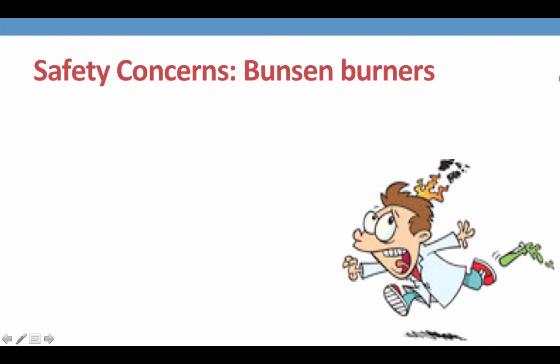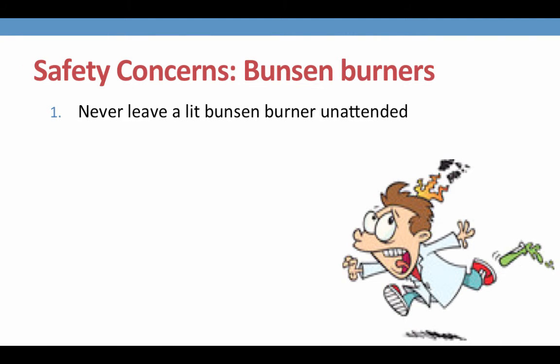Alright, so hopefully at this point you have a good understanding about what's going to be happening in today's lab. I just want to leave you with a few safety considerations before you head off to your experiment. So in addition to your lab coat and goggles, this time please remember to really leave your hair tied up well. Specifically because with Bunsen burners, one, we never want to leave them lit and unattended. So if you are heating a sample and you need your partner to go weigh something, your partner can weigh it without you. You stay with the flame.